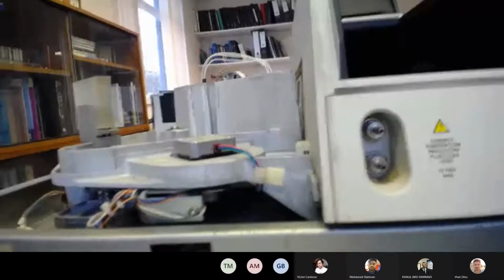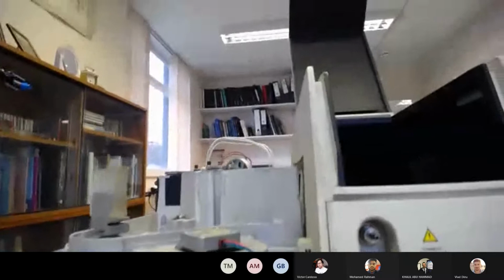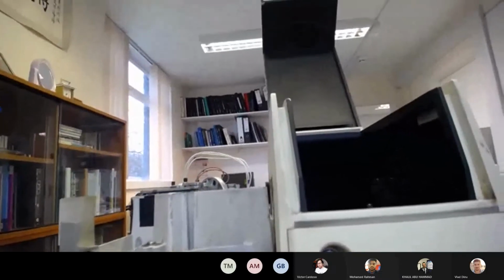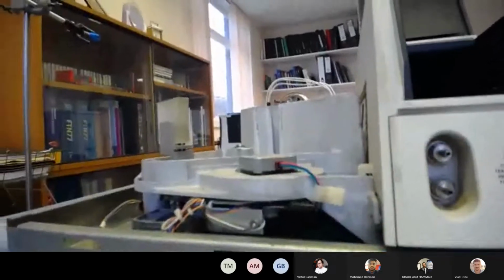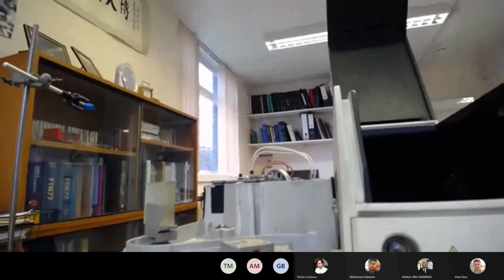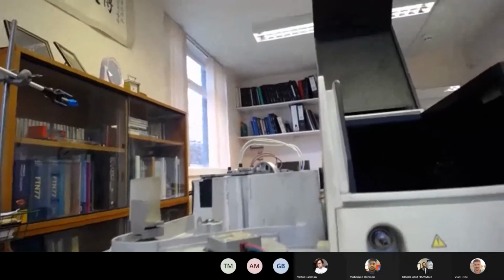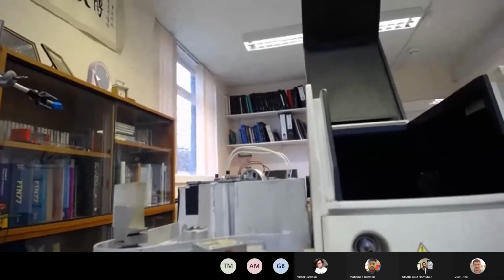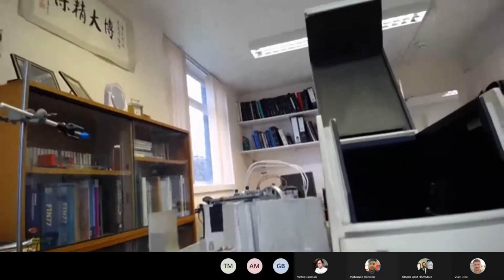There's all sorts of electronic components inside here and high voltages, so it's not safe to leave something like this exposed, particularly for general users. So the encasement of instrumentation, especially those which involve lasers, this one doesn't, is now an essential part of health and safety regulations and the safe operation of scientific instrumentation. But even a simple spectrophotometer is, I think, a useful piece of instrumentation.